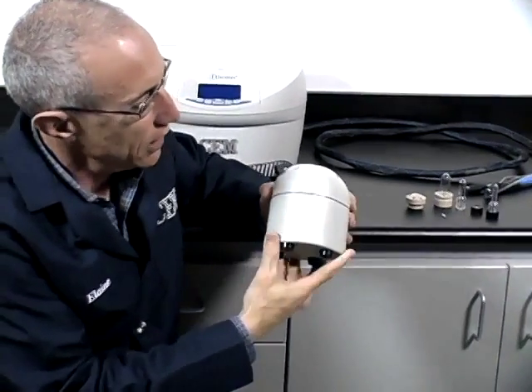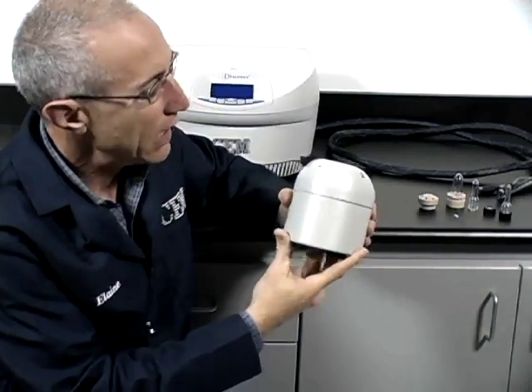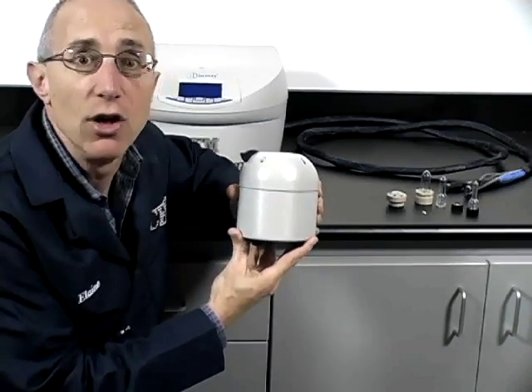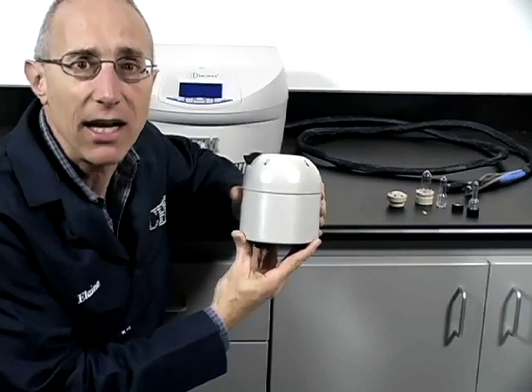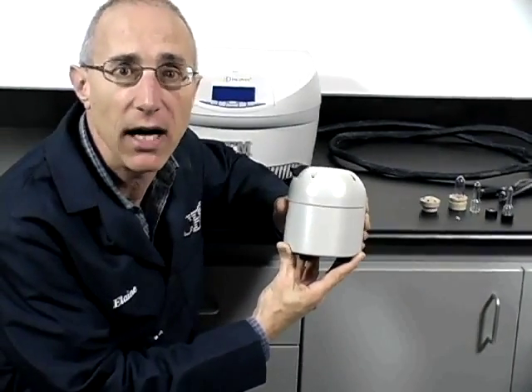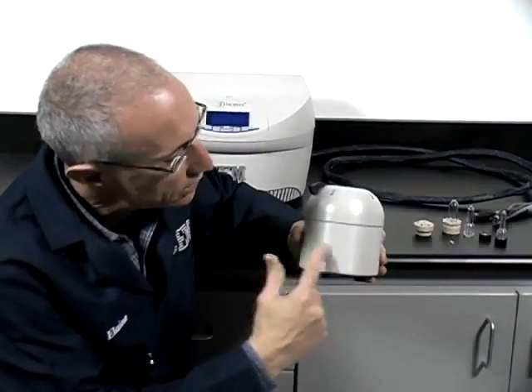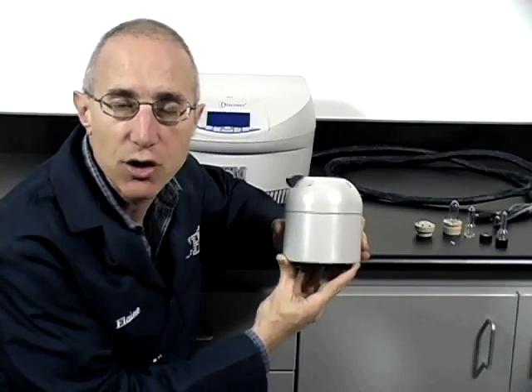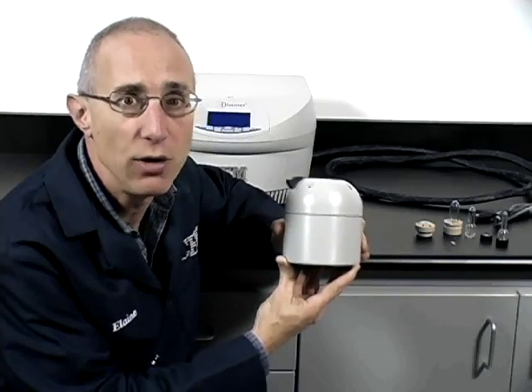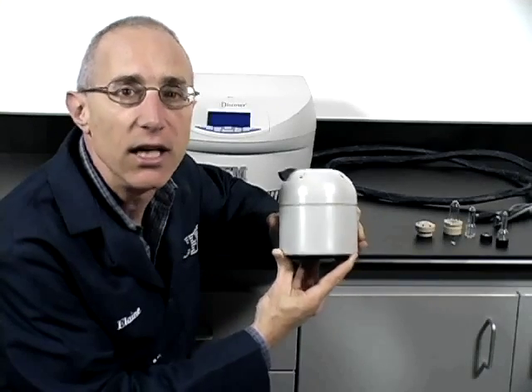The main features of the cavity: first, an infrared temperature sensor located on the floor of the cavity, looking up. The infrared temperature sensor reads the temperature of the reaction vessel contents and controls the microwave input power, bringing it up to the reaction temperature the user defines and then maintaining it at that temperature. Next, there's a stirring feature. Underneath the cavity is a feature that will stir the reaction vessel contents using off-the-shelf stir bars. If you do not want to utilize the stirring feature, you can turn it off in method programming and not place the stir bars into the reaction vessel.